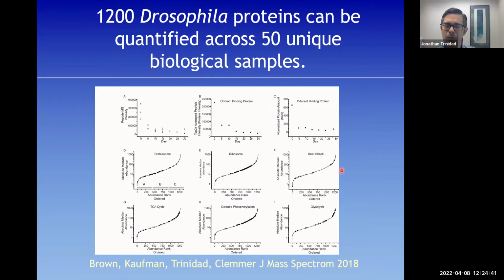So we're getting about 3 orders of magnitude of scale here, which of course is important because, depending on the system, but let's just say in humans, I think the number that people kick around is more like 6 orders of magnitude of differential protein expression between something like a histone or an actin protein that's millions of copies per cell versus something at low abundance like a transcription factor.